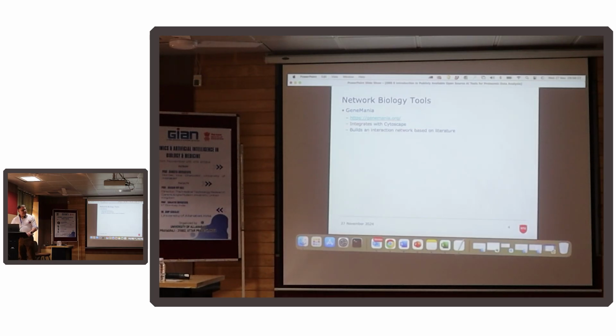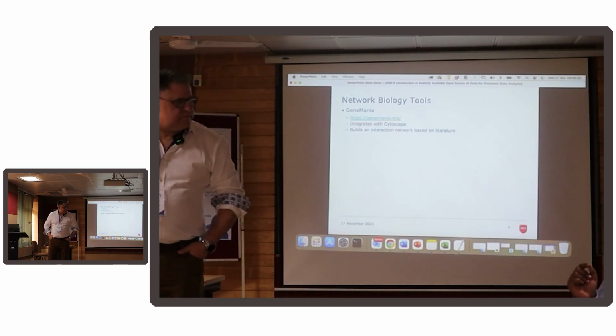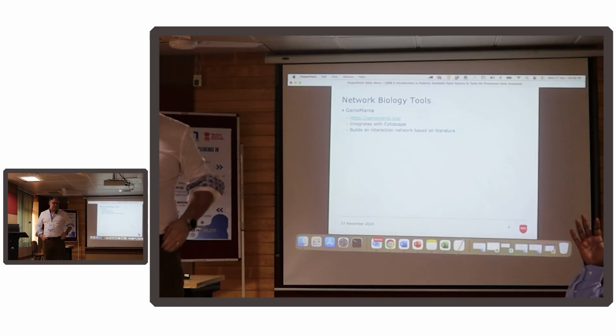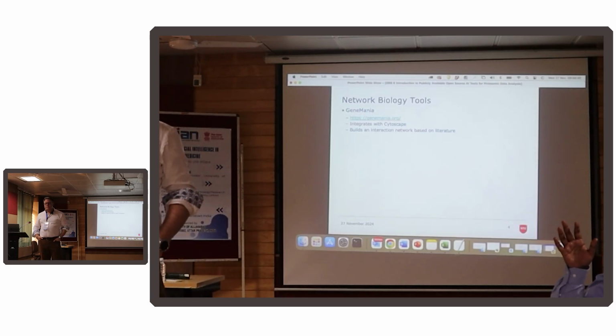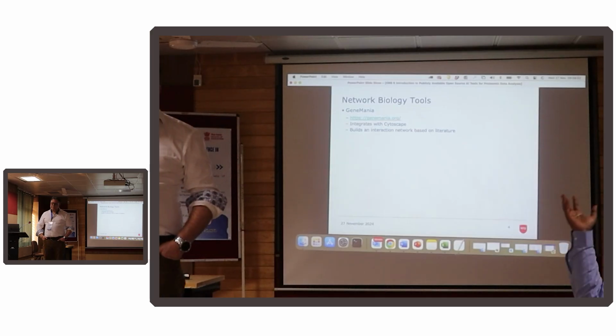So Graham is showing you some tools, right? And if I am right, Shambhu would have shown you a list of differentially expressed proteome, right, Shambhu? With Metascape, with MetaboAnalyst. So your job for the day is take a tool of your choice and use any of the tools that you find, especially network biology tools or Orange.